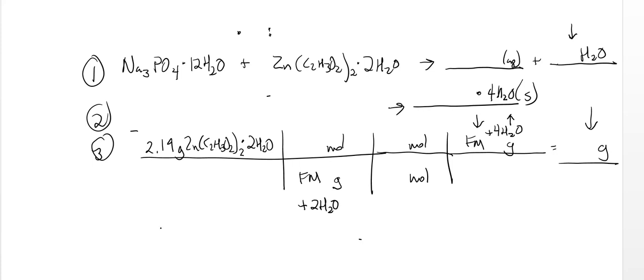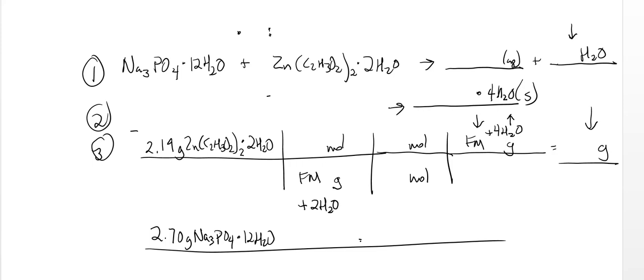You're going to have to do the same thing with sodium phosphate. So make sure that this mass right here includes the 12 waters.